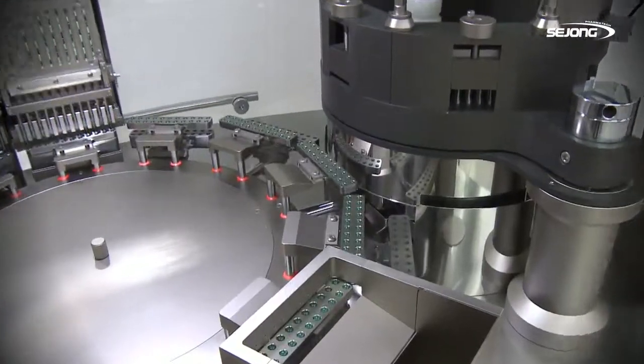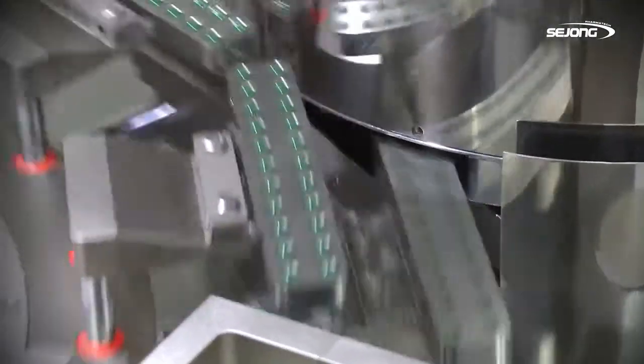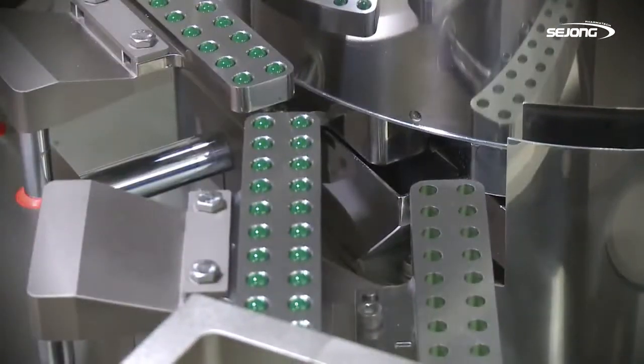And by strengthening the dust-collecting functionality of the part where the powder is exhausted, we were able to prevent the powder from scattering inside the machine.